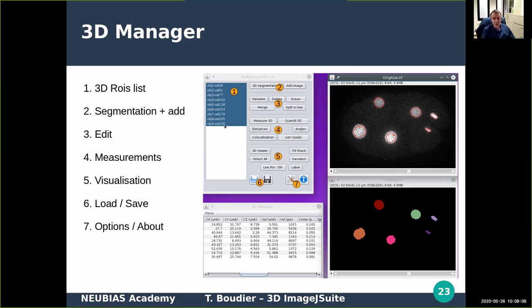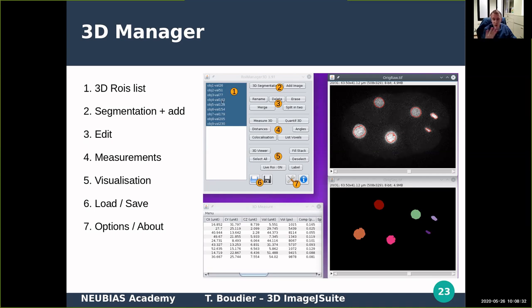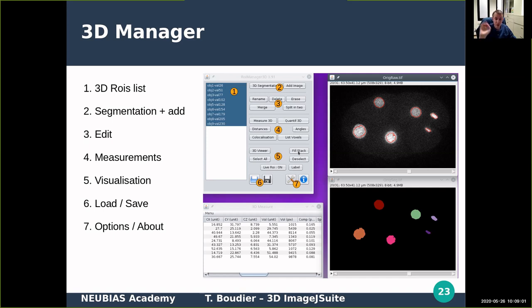For visualization, you select one or multiple objects — if no object is selected, all objects are selected by default, so no selection equals all selection. You can transfer objects to the 3D Viewer or fill them into an open stack. The 3D Viewer and FillStack work with the color pipette of ImageJ, so you first choose the color, then display. Since visualization of arrays can be quite slow with many objects or slices, you can toggle the visualization on or off.